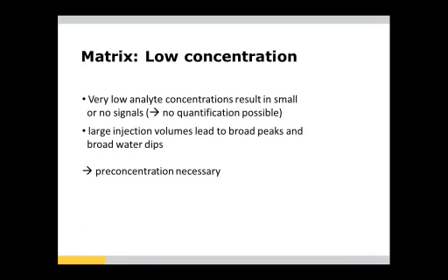When we talk about low level concentration analysis, ultra trace analysis at the ppb or ppt level, it requires sample pre-concentration. In this case, a large injection volume may lead to peak broadening, and the broad water dip would influence the fluoride quantification.